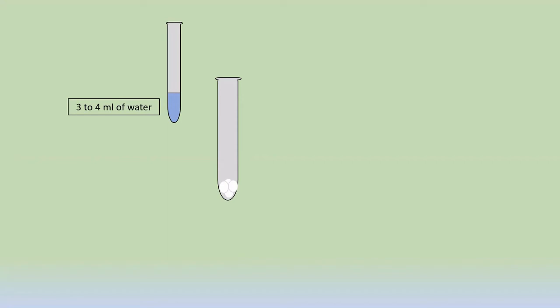Okay, I've written here 3 to 4 ml, but if suppose your compound is becoming soluble on heating, even in 2 ml of water, that is also enough. So try to use minimum amount of water. So add water to your test tube. Okay, so now we have a mixture.